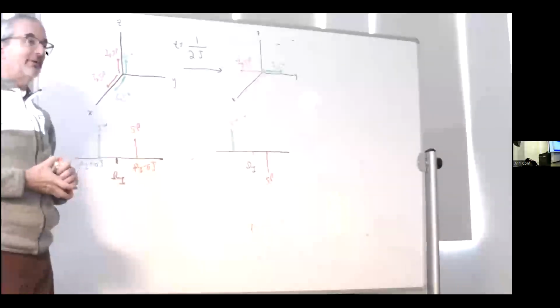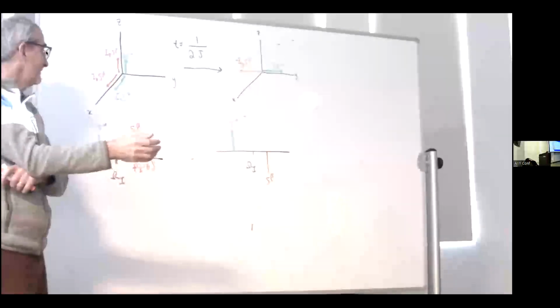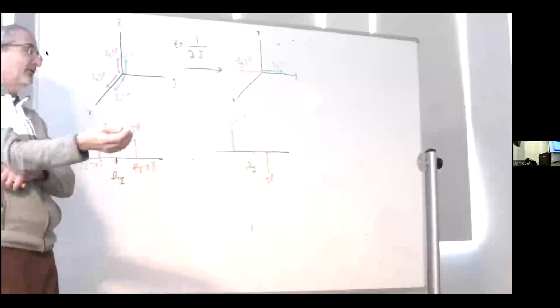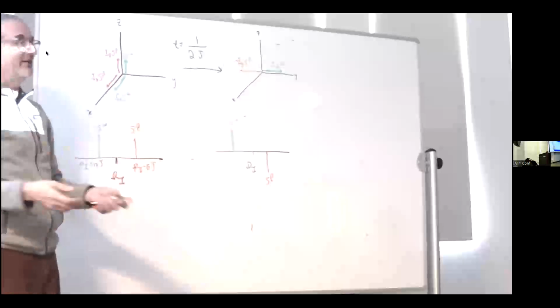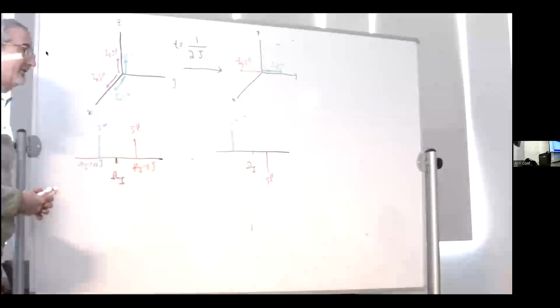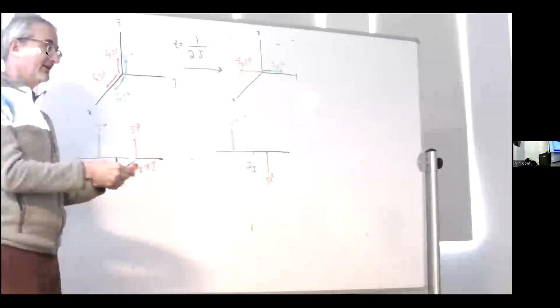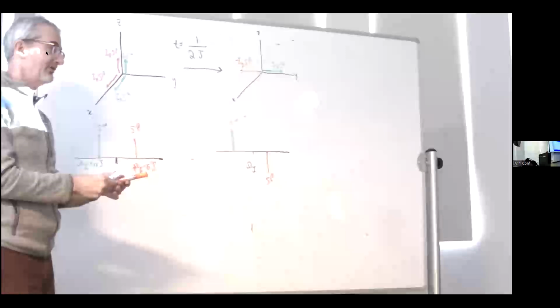But if I apply a 90-degree pulse on the protons, say a 90-degree Y pulse, then both of those components get rotated to the x-axis. If it's an ideal 90-degree rotation, my thumb on Y, my fingers go towards plus X. So they're oriented in the same sense, which we would call being in phase with respect to each other.